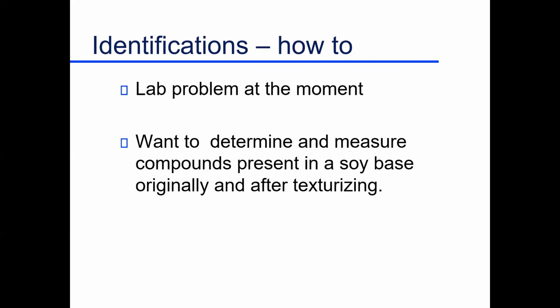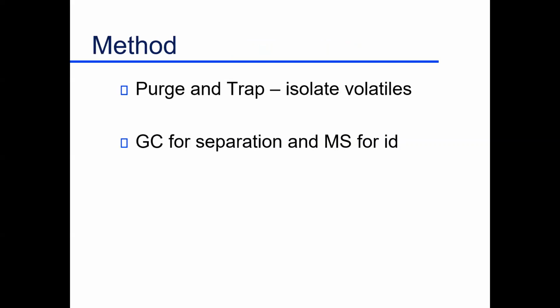And she's looking at a soy base before and after texturizing. At least she didn't tell me too much. How's that? That's what I think it is. So she was doing a purge and trap for volatiles to collect volatiles from her product.